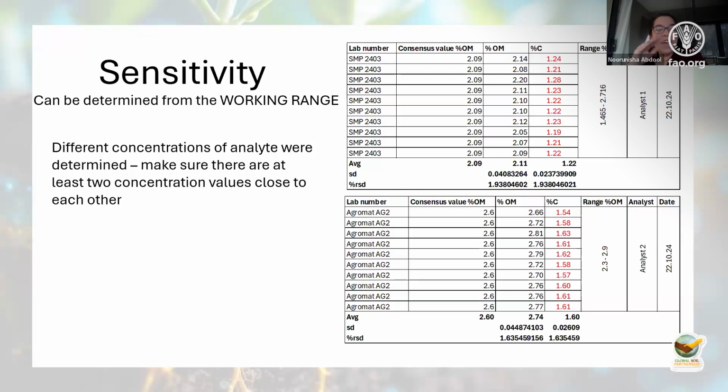And that's something we have to get used to in method validation. Sometimes it's as simple as a titration: here are your values, Walkley-Black carbon has been validated. Or it could be an ICP method where your matrices are different. You've got massive interferences. Your one ICP has no issues at all with interferences, while the one right next door to it does have massive interferences. So it's also about understanding and interpreting what you are seeing and how to account and adjust for that. Okay, slightly off the topic.